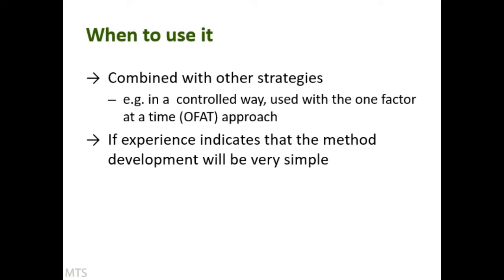The other thing to mention here, though, is that if you have a lot of experience in method development, you might just look at a method and know that's going to work straight away. So you might do a trial and error that's maybe 2-3 experiments just based on your previous experience. So sometimes that could be a good thing to do.